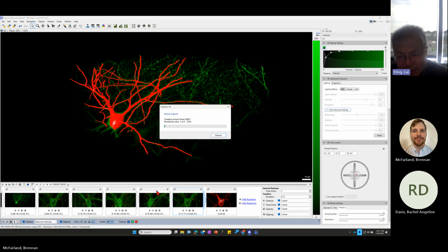What does the slice mean? There are two. That's a two channel, the green and the red. Is that rendering slice 1 of 2? Yeah. I'm wondering if it is an object layer and then a volume layer, because we do have both. Okay.